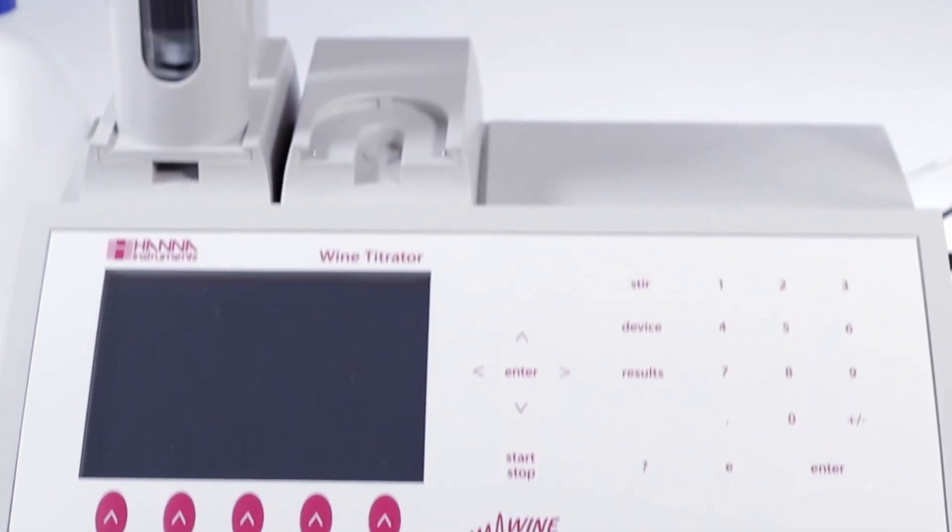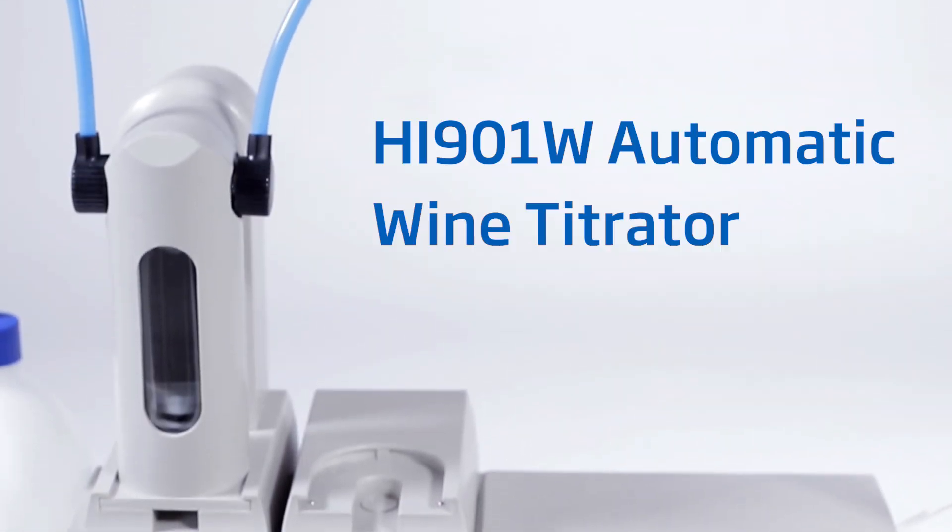The HI901W was created specifically with winemakers in mind. It provides you with accurate results, is easy to use, and gives you the ability to expand the system as your analytical needs grow.